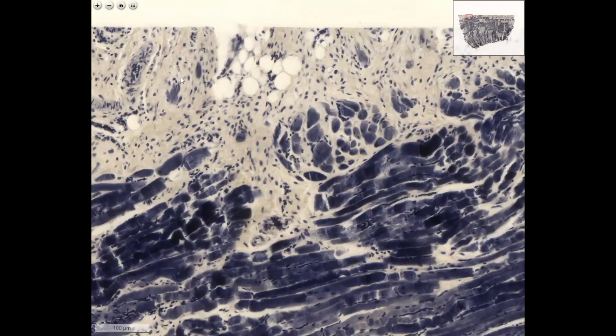This is loose connective tissue with some blood vessels and fat cells. We know that the size of the fat cells is between 50 and 100 micrometers. The profiles of the cross-section of the skeletal muscle and the longitudinal cuts are in the same range. So the skeletal muscle fiber diameter is about 50 to 100 micrometers.